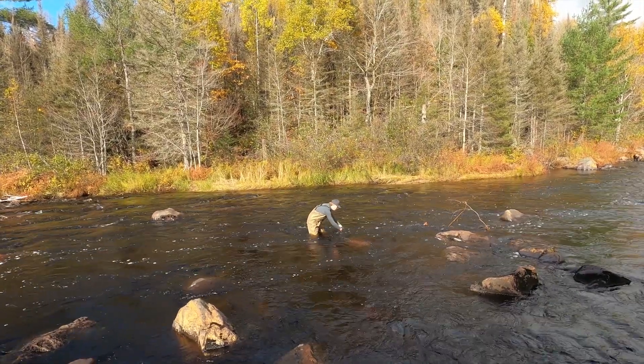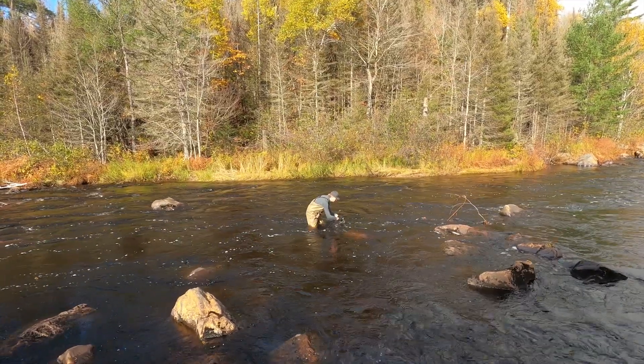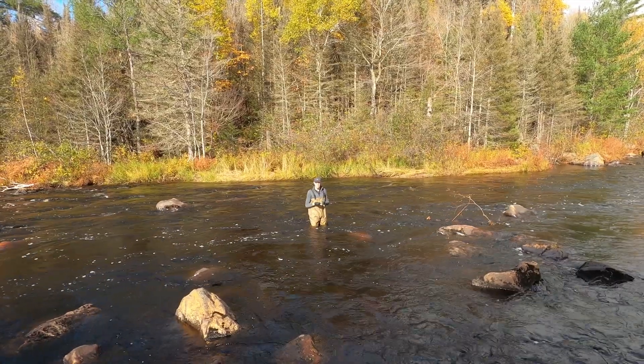I'm filling the cap underwater and then putting the cap back on underwater, making sure that there's no air trapped in it so we have a good sample.